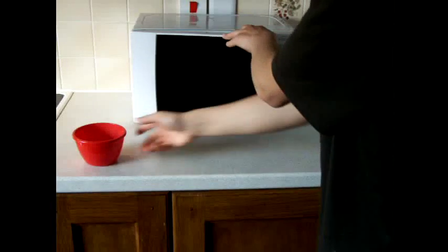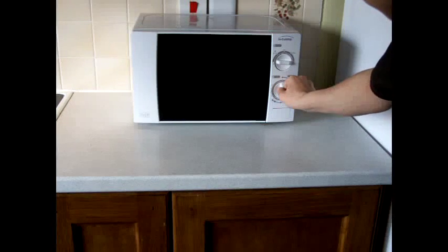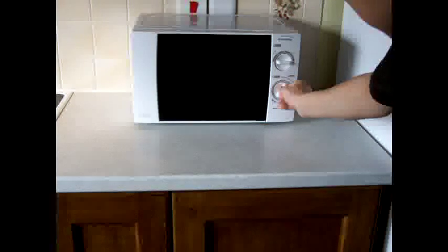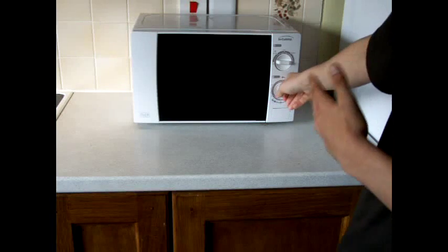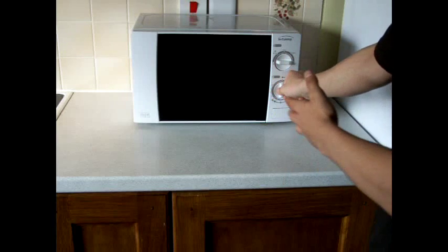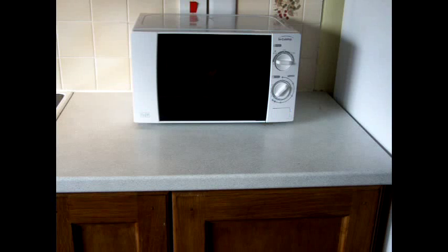Put the solution in the microwave until it begins to froth. Now it's plugged in properly — put the solution in the microwaveable bowl and turn it on until it begins to froth.